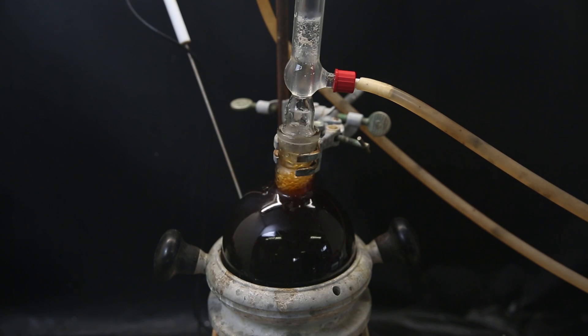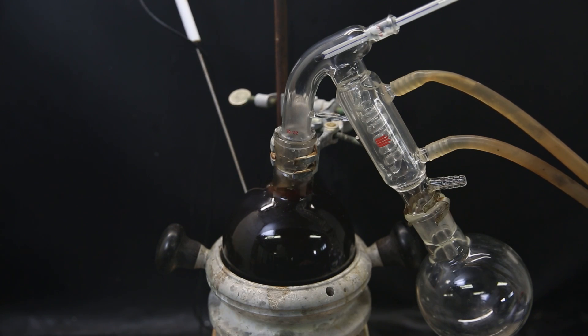When I return, the mixture has become a dark red, and I replace the condenser with a short path distillation apparatus. First, I distill off part of the solvent under atmospheric pressure because it's quite full.